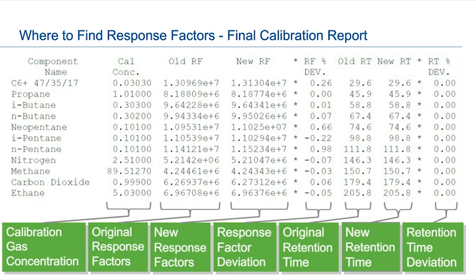Okay. Well, there's a lot of questions. So I'm going to just go through this and then try to answer some of these questions at the end, or we'll never get off this slide. So again, the final calibration report is really good to understand where the response factors are.